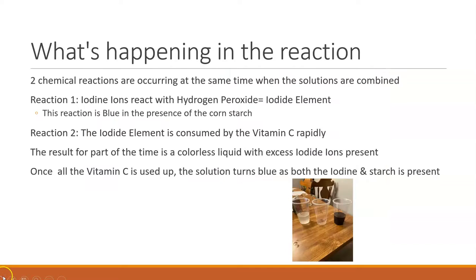Okay, here's what is essentially happening in that reaction. Approximately after a minute and a half, just under 2 minutes, the chemical reactions took place and changes occurred. As you can see in the photograph, cup solution B is now very dark, a darkish blue.